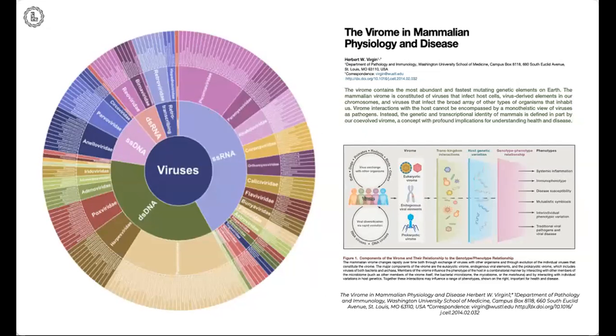Of course, while using the Silva database and trying to quantify the microbial species into their respective bacterial taxonomy is a simplistic approach, because this does not give us all the members that are present in the microbial community, right?